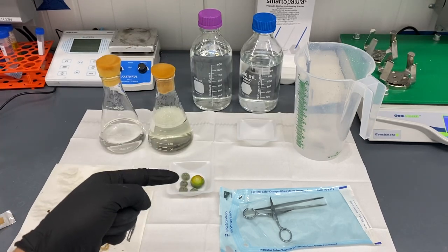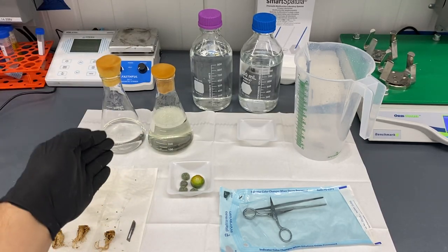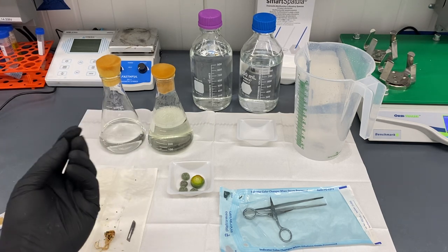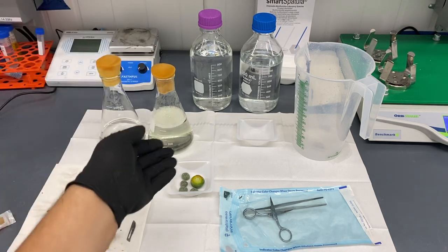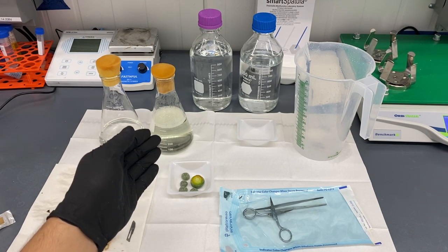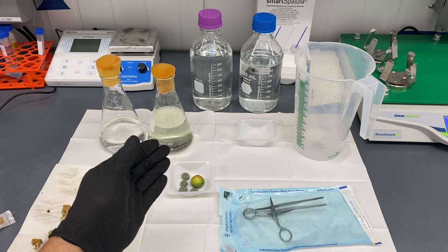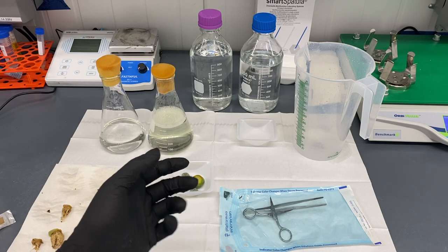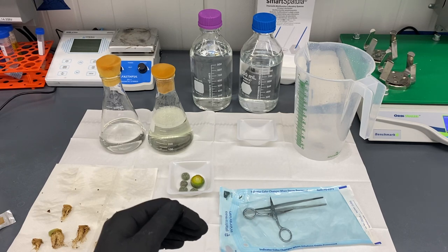Now we're going to put all of these pieces through an alcohol wash. This is a 70% isopropyl alcohol wash for two minutes, just to get off any debris or anything bacterial on the outside. Then it's going to go into a 20% bleach solution for about 25 minutes. That might seem intense, but the Lophophora has a very strong outer cell coating so it can handle it and will be completely fine.